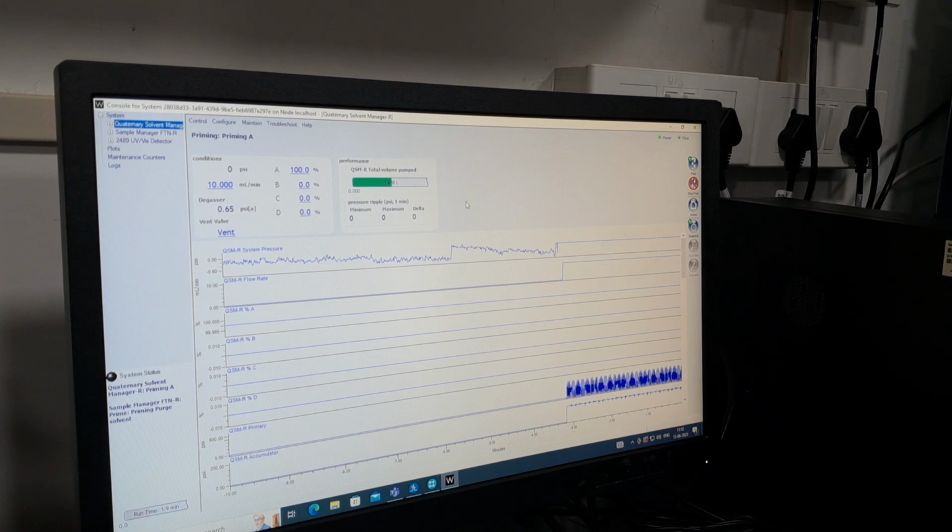0.5 is the minimum sample volume, right? 0.5 to 50 maximum, 50 microliters you can do. How much volume do we need to keep? We have 2 ml vial holders actually. Maximum 2 ml you can hold, and minimum I think 0.5. Like minimum 400 microliters is the residual volume. Maximum you can hold up to 2 ml. The injection volume you can take up to 50 microliters.